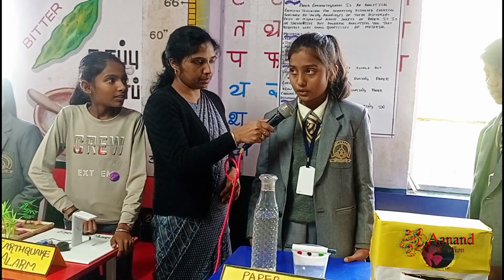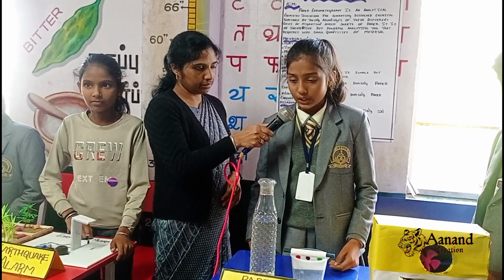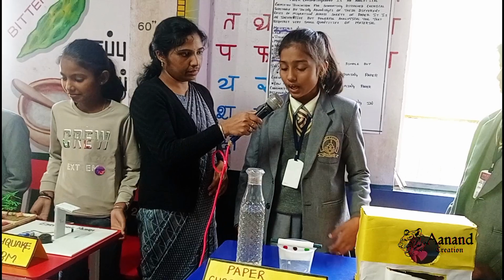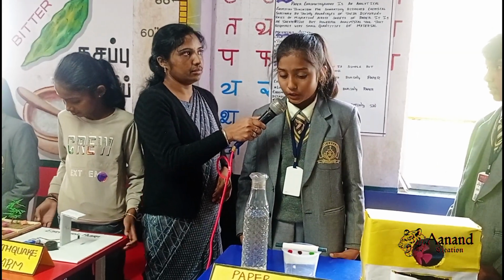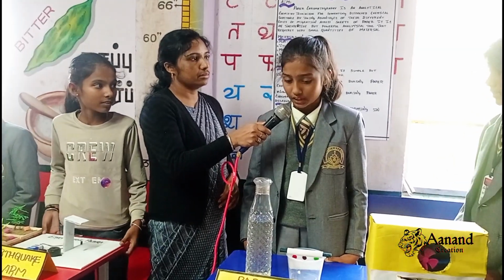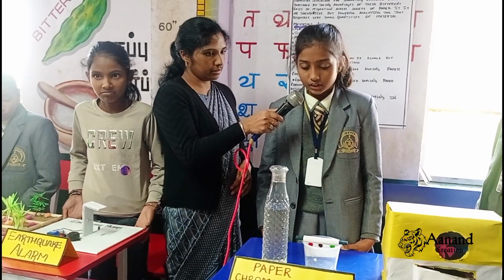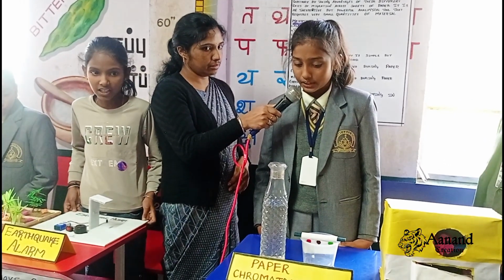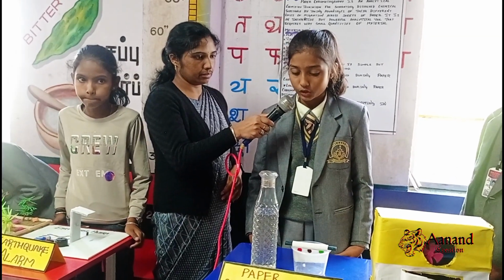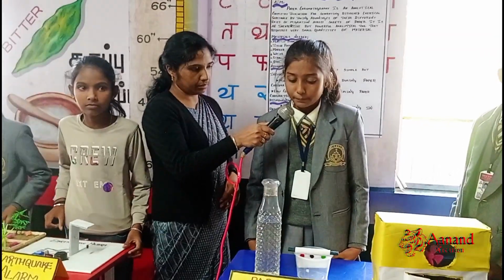What are the different types of paper chromatography? Descending, ascending, radial, two-dimensional. These are the different types of paper chromatography. Advantage: paper chromatography is a simple, inexpensive and sensitive method. Minimal equipment is required during paper chromatography. Low cost materials are used. Disadvantage: it is difficult to maintain uniformity in paper chromatography.